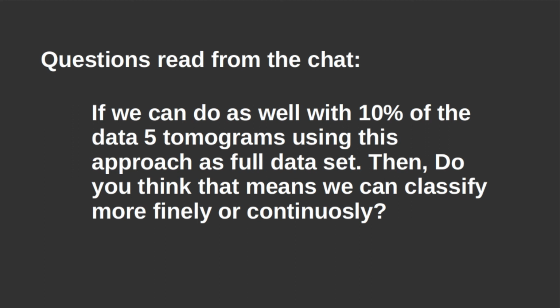Now I'm not sure if I get the question, but yes. So ideally, if you can get the same resolution with less data, then it means that if you have some conformational changes in your data, because that's the problem, right? For tomography, the classification is typically not working because there is not enough data to really create meaningful classes. So yes, the better data you have, the better. If you reach the same resolution with less particles, then of course you have higher chances to classify them better if there are some conformational changes at this resolution that you would like to pick up.